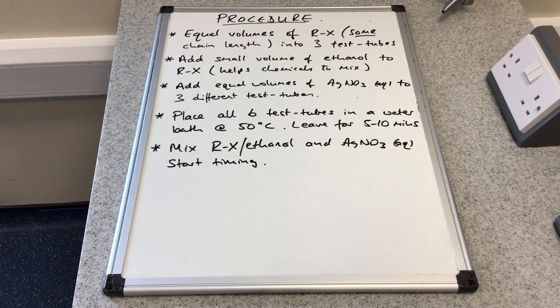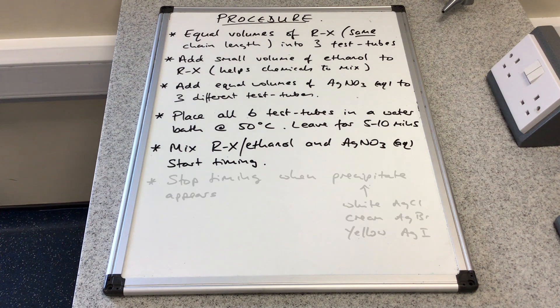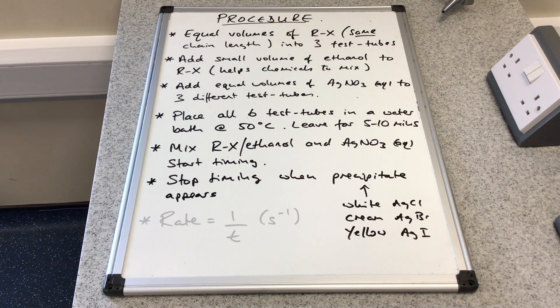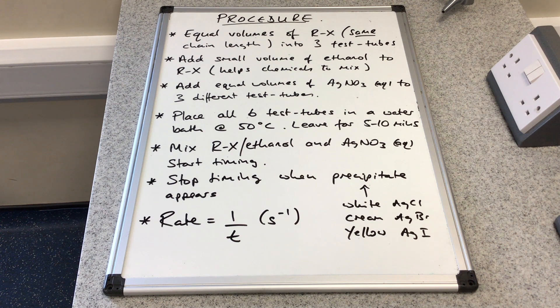Once they've had their required time in the water bath, you'd take one of your haloalkanes out and one of the silver nitrate test tubes, mix them together, and start timing. You'd stop timing when you see the precipitate appear. The white precipitate would indicate silver chloride from a chloroalkane, cream silver bromide from a bromoalkane, yellow silver iodide from an iodoalkane. Finally, the rate would be expressed as one over the time with units of seconds to the minus one.